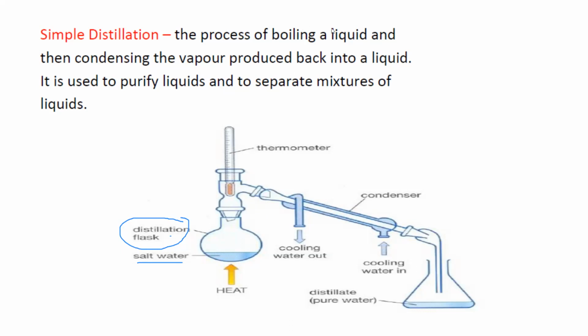But when you supply heat energy, what will happen? The water will turn into vapors. The salt will not turn into vapor, the salt will be left behind, and the water will turn into vapors. As this water turns into vapor, it enters a region called a condenser.